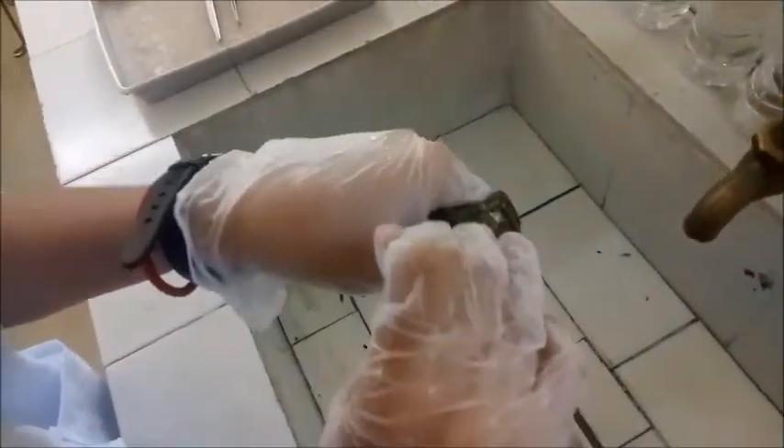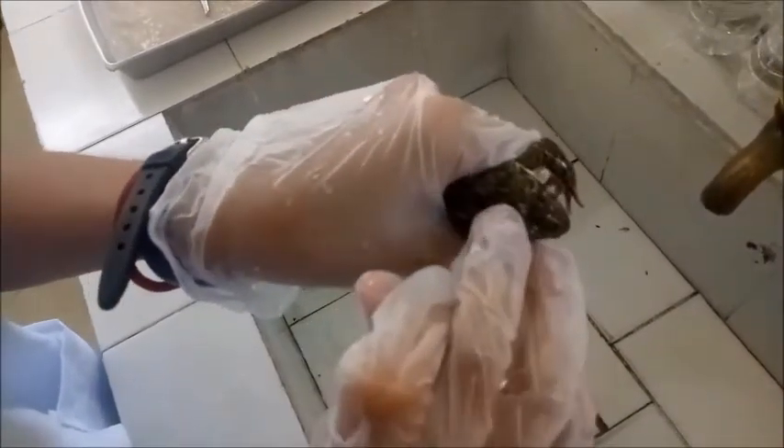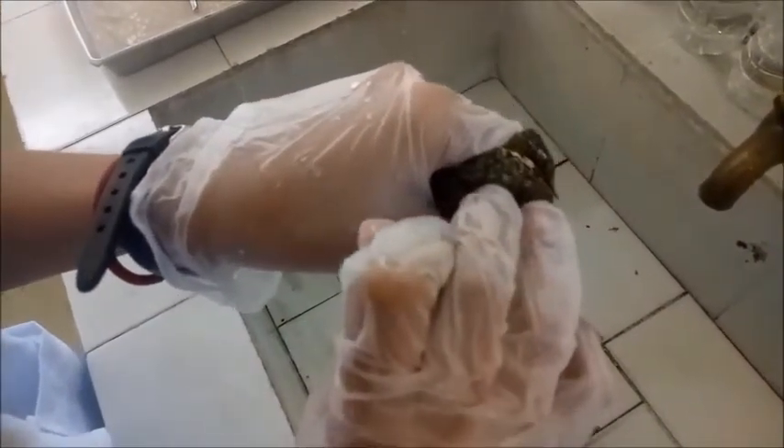First, you prepare the frog to examine its external anatomy. You need a clean dissecting tray and some things to hold the frog's skin out. In pithing the frog, we need a pithing tool inserted in the middle of the neck. Pithing is a technique used to immobilize the frog by inserting a needle in the middle of the neck. Place the frog ventral side up on the tray.